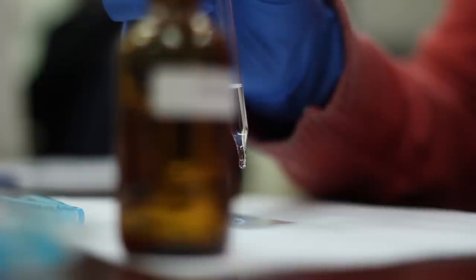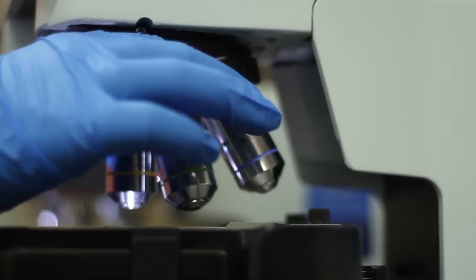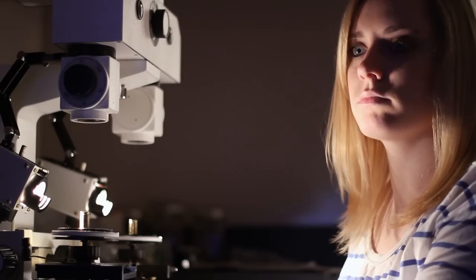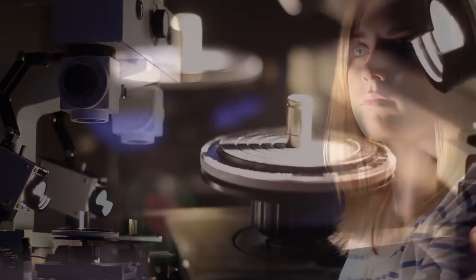This class is Forensic Science 205, which is Microscopic Methods and Forensic Analysis. What we're trying to do with a class like this is get students the opportunity to learn how some of the microscopes that we use in crime laboratory settings work.